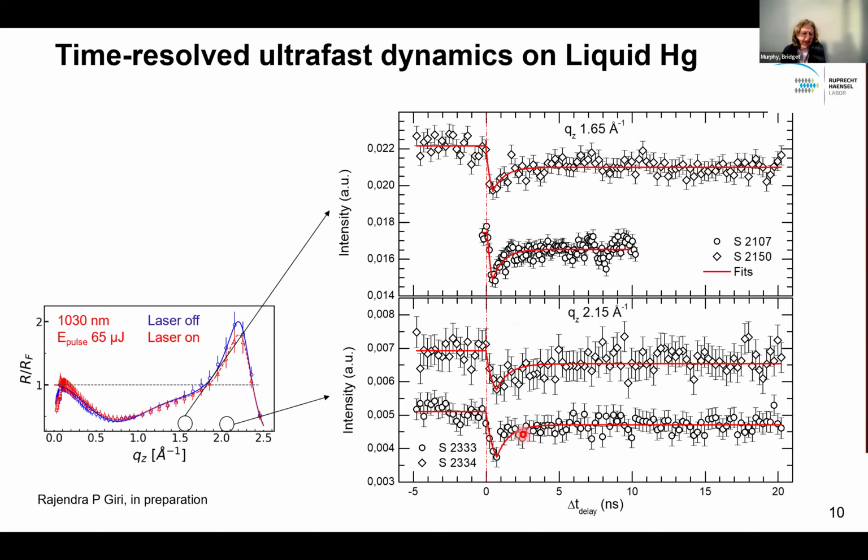So this is the second evidence that we really see an effect. And here at the front, where we would also like to measure, that's quite difficult because it's much harder to keep everything well aligned there. So we're not so sure if we trust that data. Well, it's not that we don't trust it, but the error bars are larger when we do the fitting.